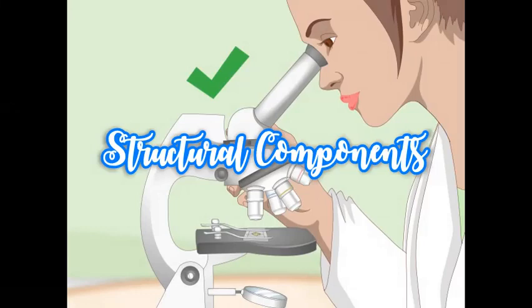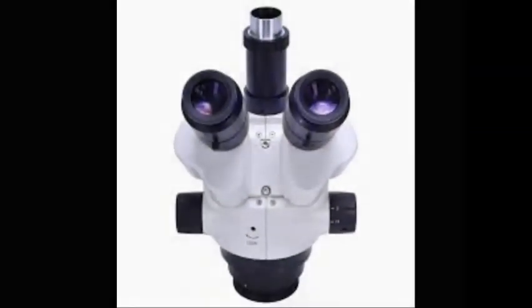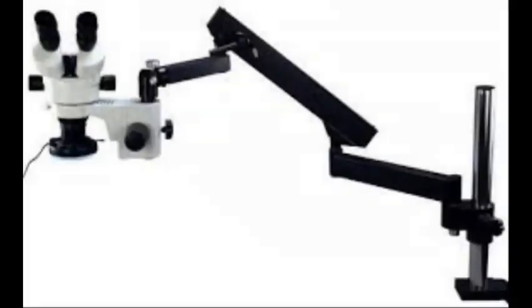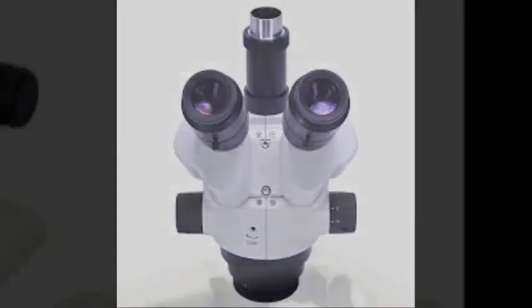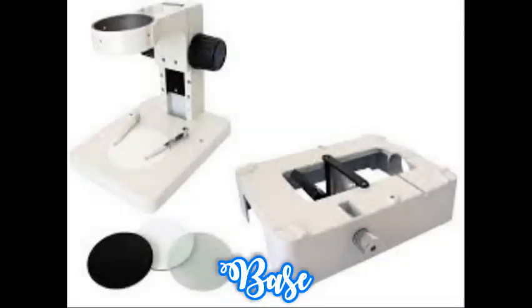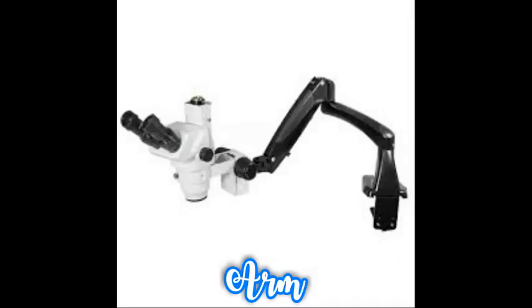Structural components. The three basic structural components of a compound microscope are these: head, base, and arm. Head or body: the head or body houses the optical parts in the upper part of the microscope. Second, the base. The base of a microscope supports the microscope and houses the illuminator. And lastly, the arm. The arm connects to the base and supports the microscope head. It is also used to carry the microscope.